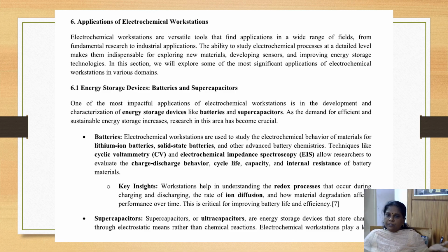CV, cyclic voltammetry, linear sweep voltammetry, and electrochemical impedance spectroscopy allow researchers to evaluate charge-discharge behavior, cycle life, capacity, and internal resistance of battery materials. Supercapacitors or ultracapacitors, which are energy storage devices that store charge for a long time, can also be studied using the electrochemical workstation. And they play a key role in the study of supercapacitors.